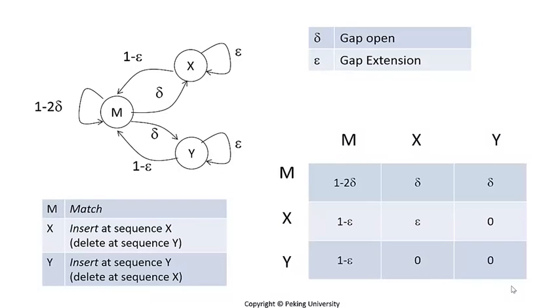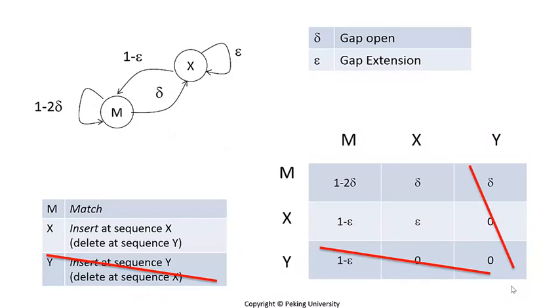Therefore, we come up with a straightforward solution. We just need to use the hidden Markov models mentioned with some modifications. For example, we can reduce the probability of the transition to the gap state on short sequences, i.e. reads. We can even remove such states. This method can avoid a very big penalty on short reads. However, the quality of the final alignment will also be affected. Besides, the computational overhead is very big.